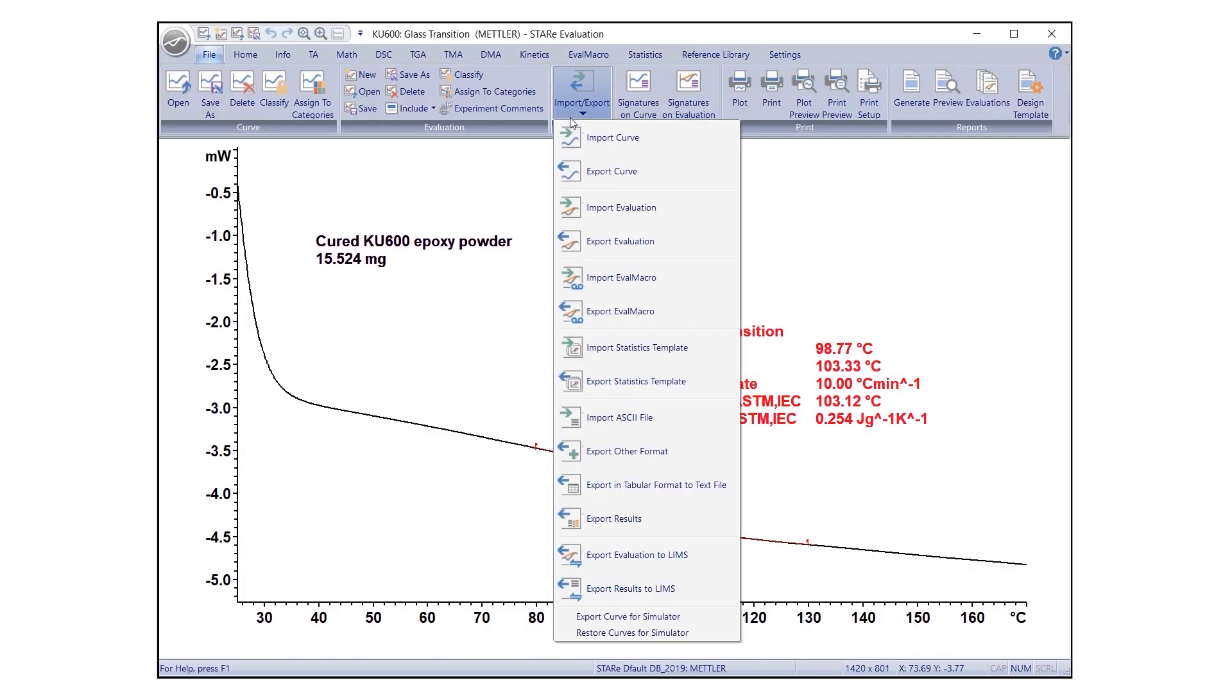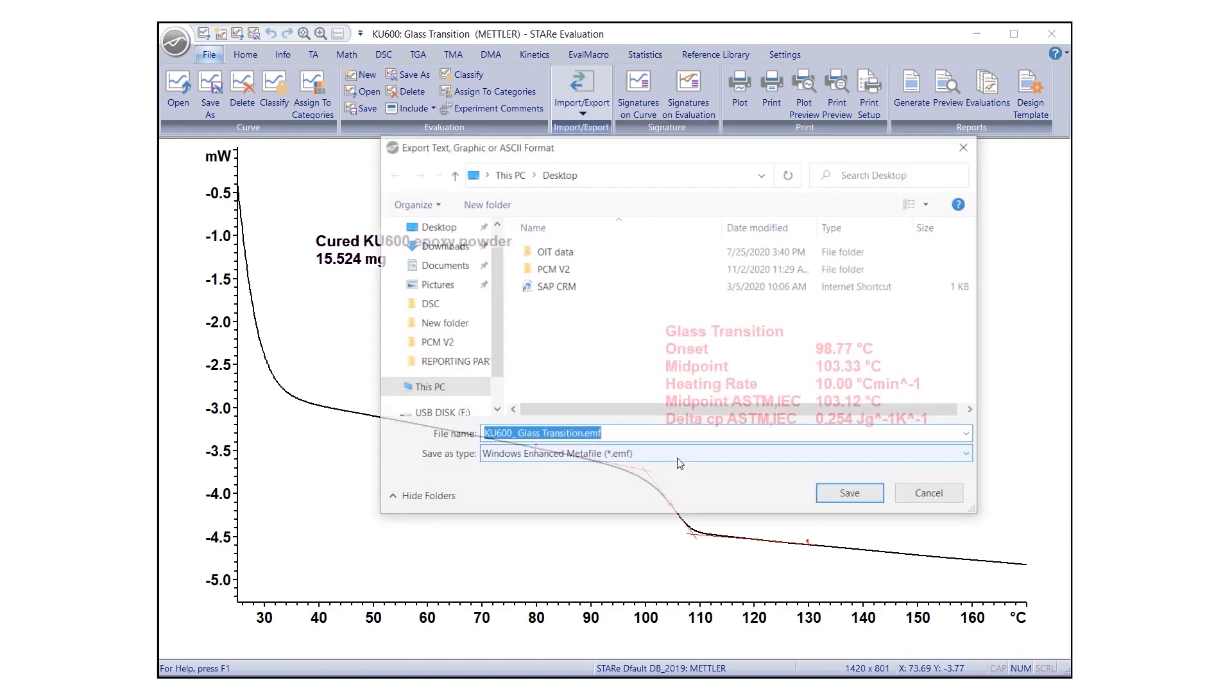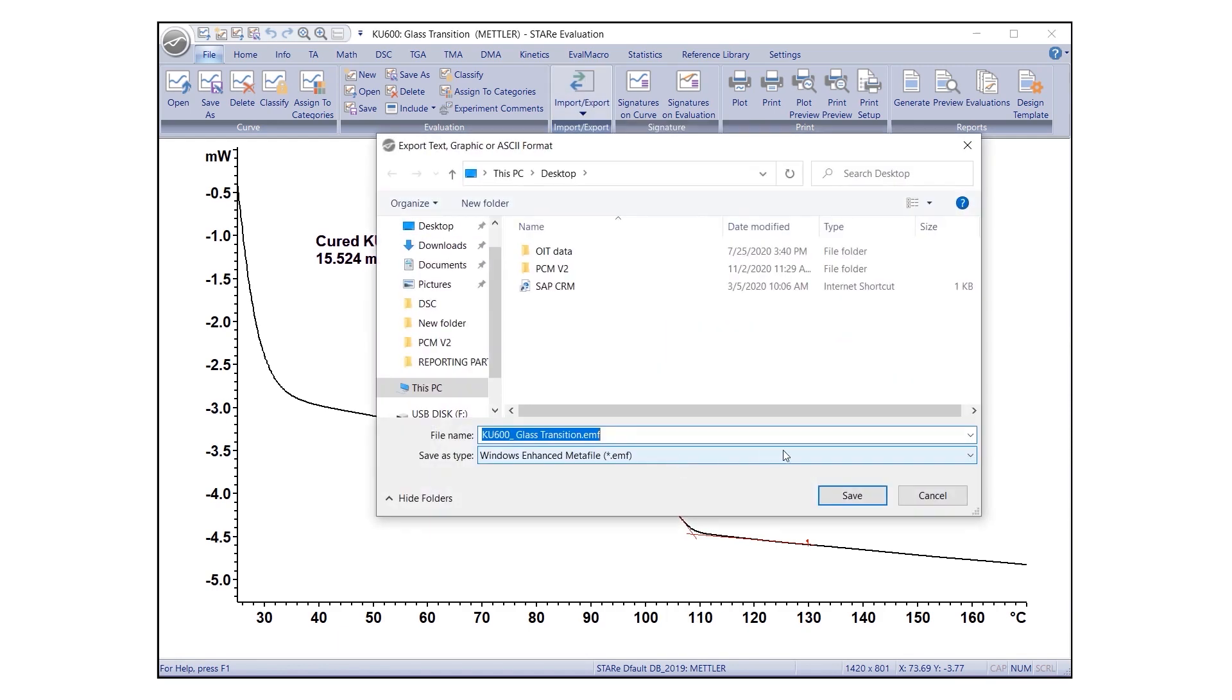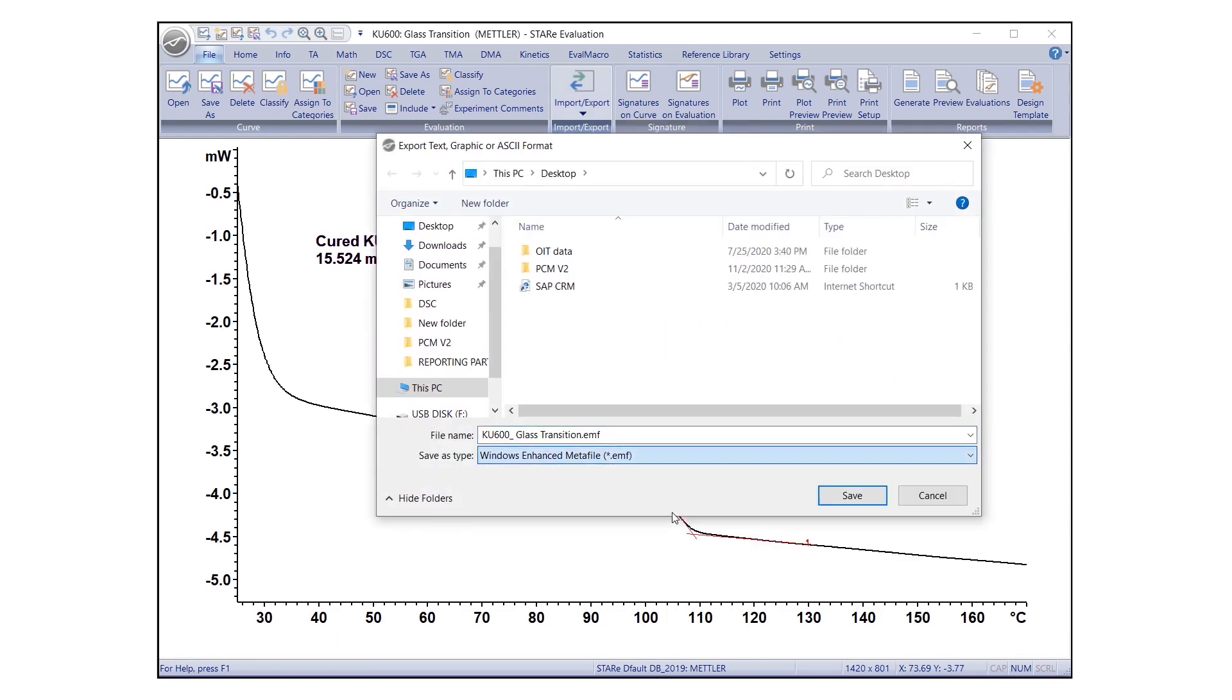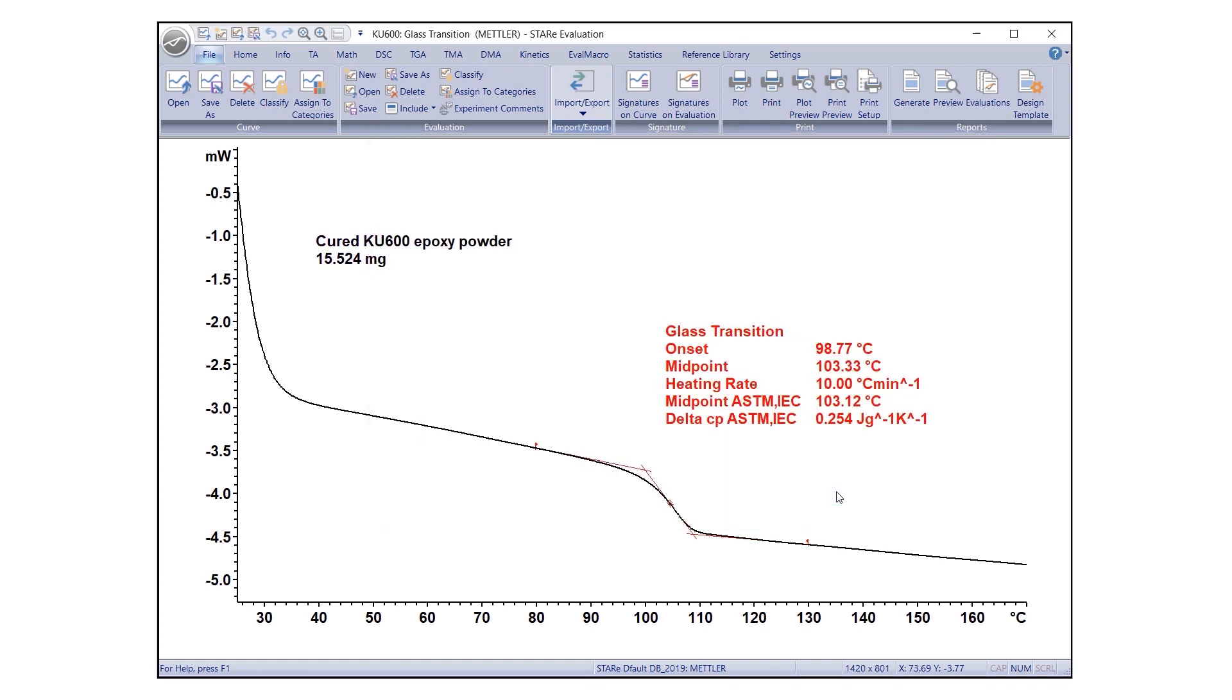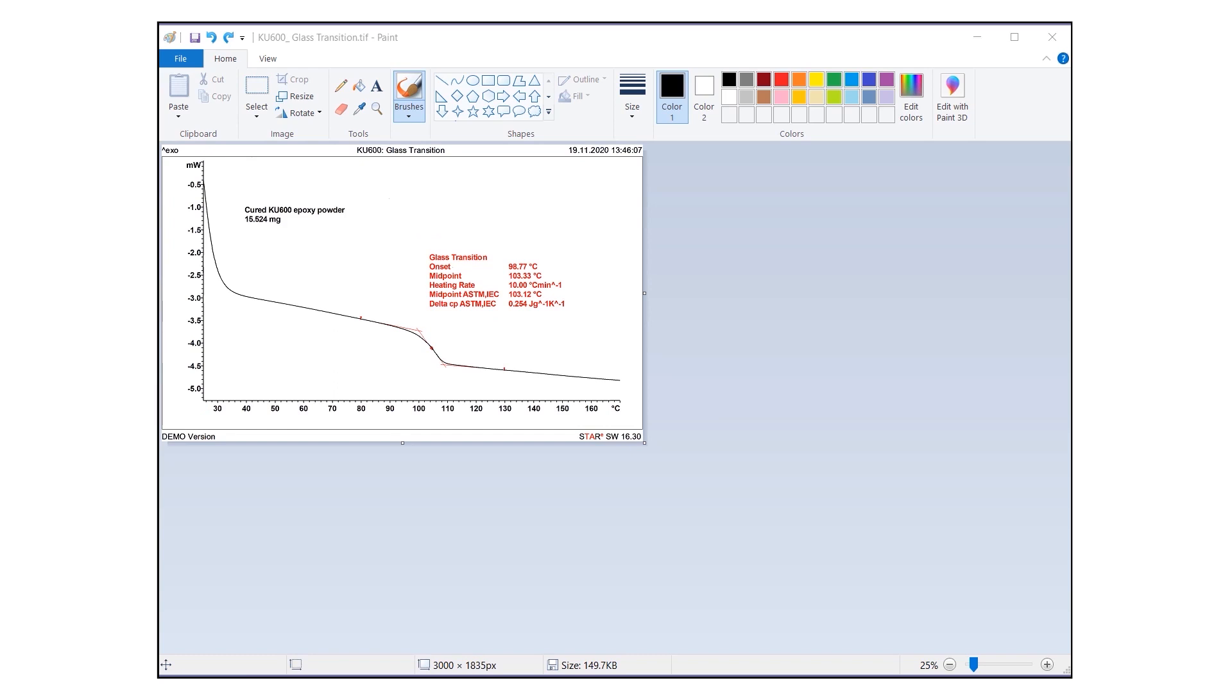One can export the evaluation in image format by selecting Windows Enhanced Metafile. The evaluation will be exported as a .emf file. This format enables graphical changes to be made, even after export.